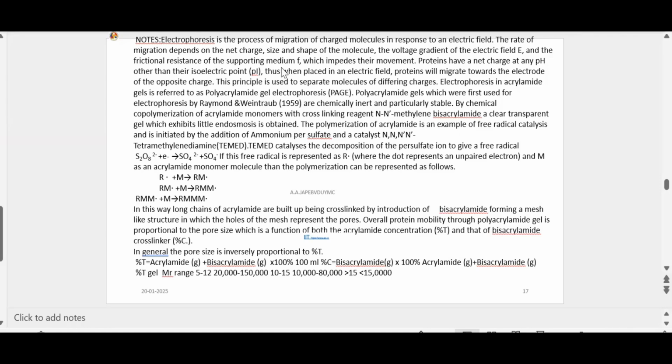Now here, in case of SDS-PAGE, if you remember, we had talked about the solubilizers, right? Now, when I say this, what I mean by it, let's look into the summary, right? SDS-PAGE, right? Are you able to see this particular slide, right? This is a screen that is available on the internet. It is produced by Thermo Fisher Scientific. I'm sharing their screen.